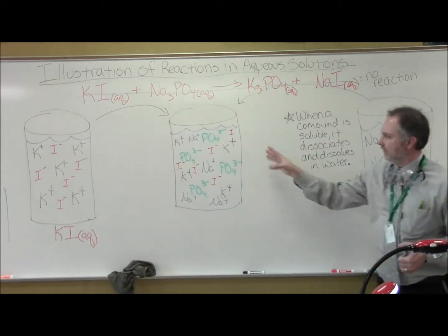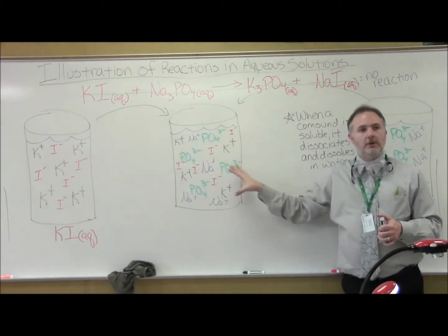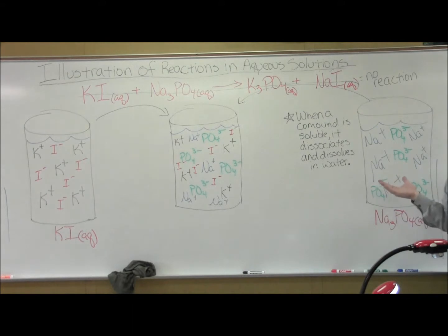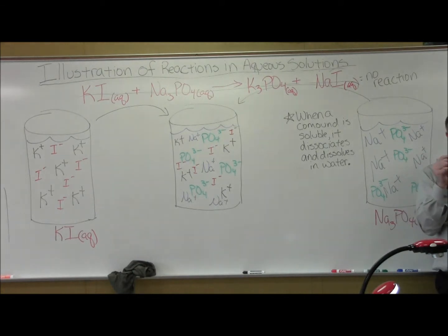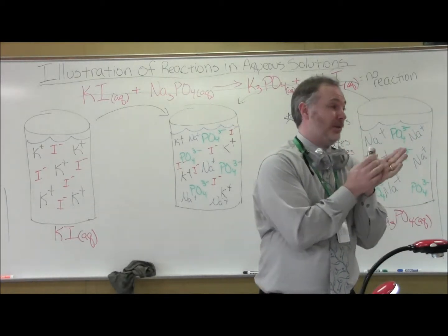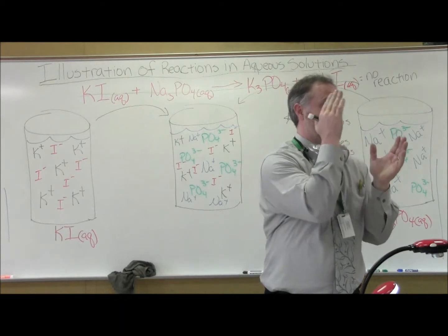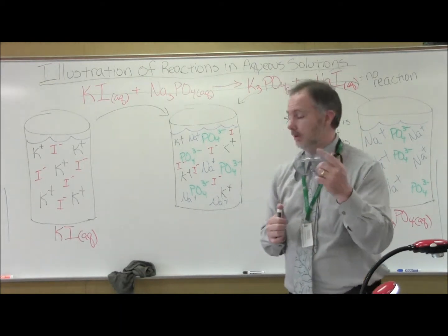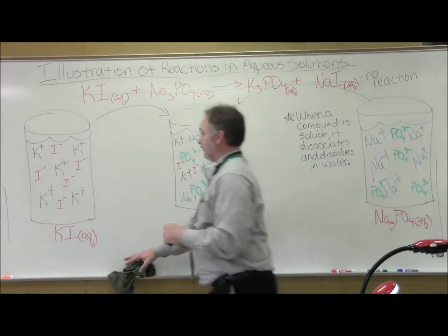Now I want us to see, all that stuff is in here, okay? It just didn't do anything because it stays dissolved. All right, let's do one where I'll spoil the ending. We should see a reaction, okay? And I hope this helps you see it, and I hope it helps you understand the net ionic equation part of it, okay? Not just the reaction part of it. So I'm erasing all this.